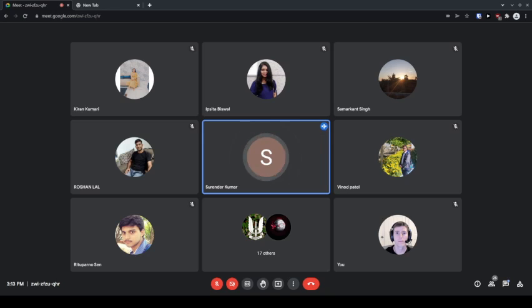And then you can calculate the crystallite size, and you can get information about the strain in the system. So these are some basic pieces of information you can get from there, but there are many. These are mainly the main things that you can get. So the next thing, a very important topic, we are going to introduce today. Let me share my screen.